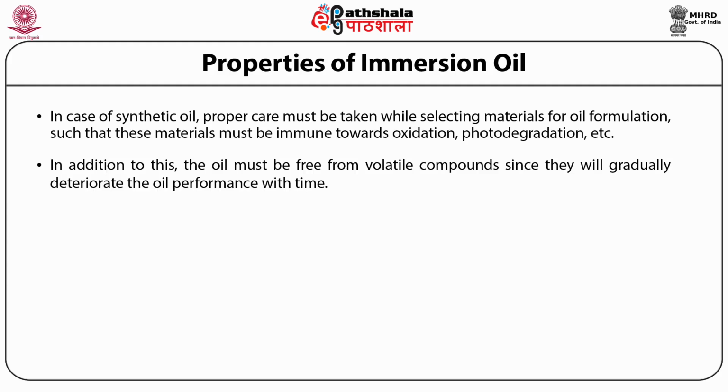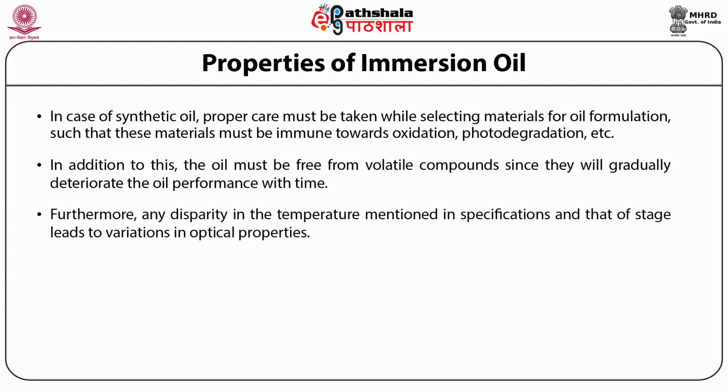Furthermore, any disparity in the temperature mentioned in specifications and that of the stage leads to variations in optical properties. Deviations occurring from stage temperature are the most severe and must be considered carefully.